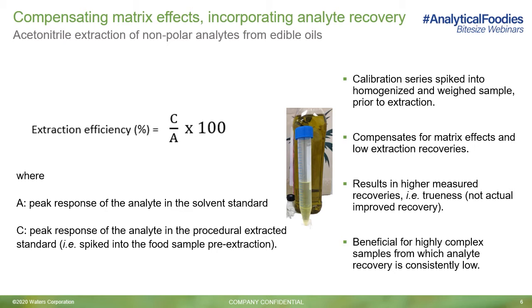This approach allows analytes which yield consistently low recoveries to be adjusted within the sample preparation procedure, while also compensating for matrix effects. So it's very useful in highly complex foodstuffs such as cereals or edible oils, especially if internal standards are not available to correct for analyte loss.